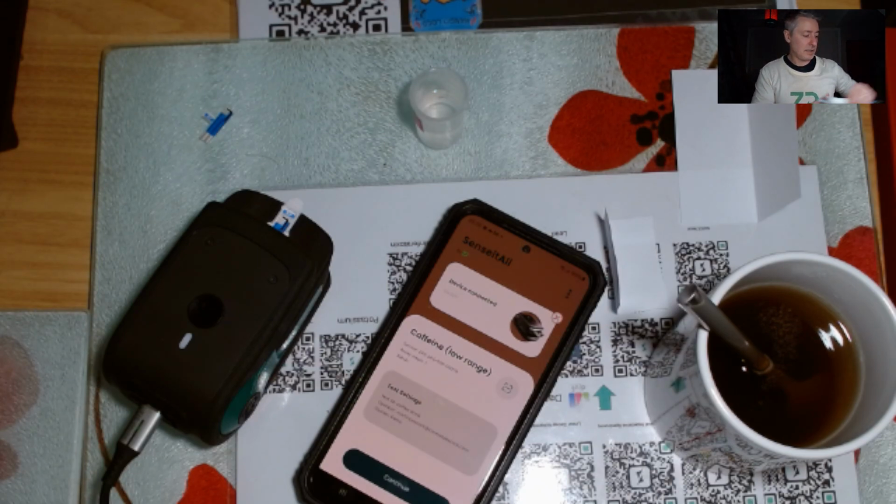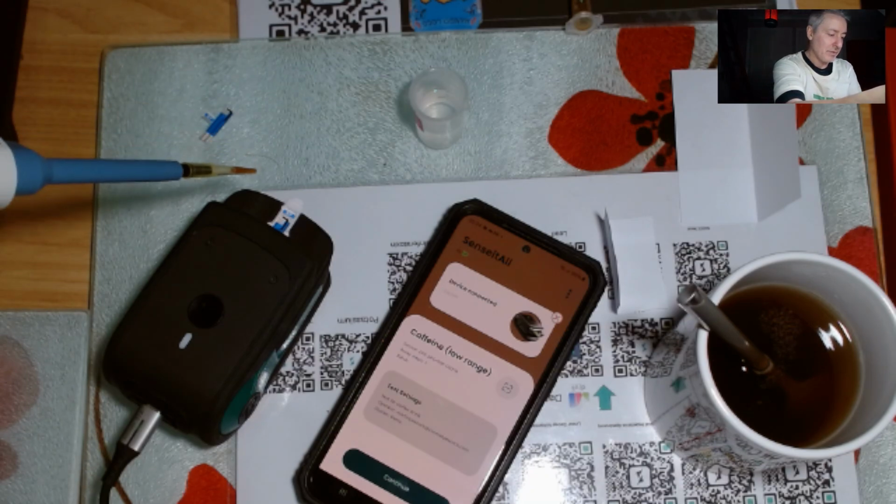I'm going to take, love electrochemistry, 50 microliters. It's almost one of the analytical sciences, especially for the liquid phase, that can work with really small volumes. I wonder if it's the one with the least requirement for volume of some of the analytical sciences. I've got to be a little bit careful with that statement. I'm just thinking out loud a little bit.